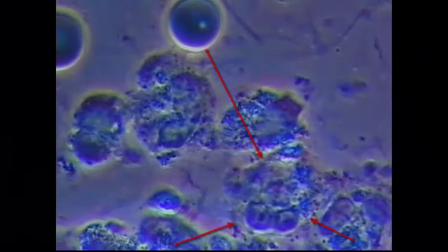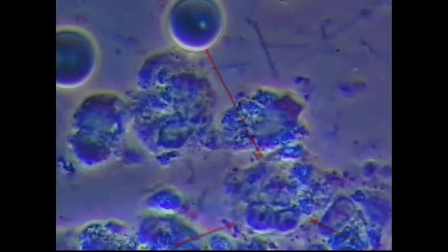If you could focus on the cell that is highlighted with the red arrows, that is a PMN. It is a specific type of white blood cell that lives for about three days and then they get replaced with new ones.